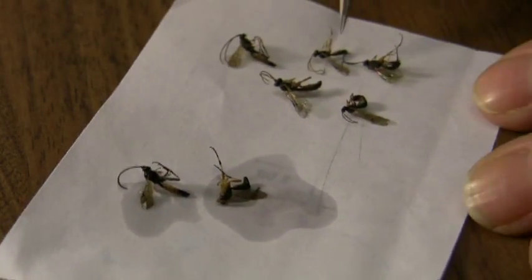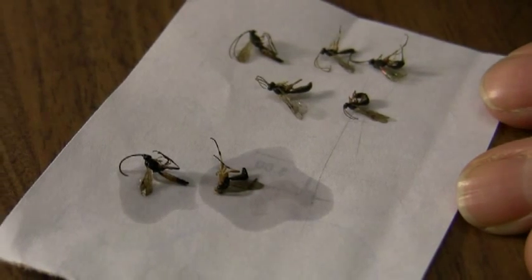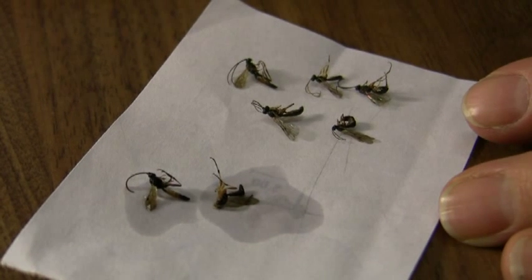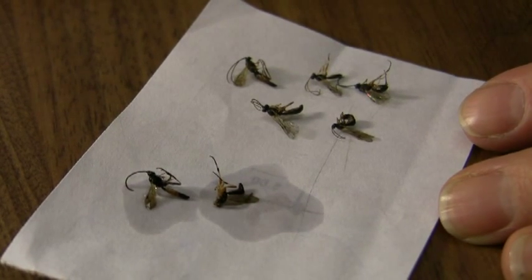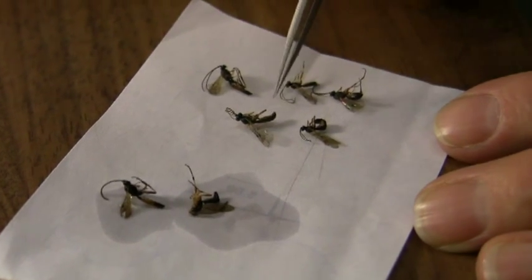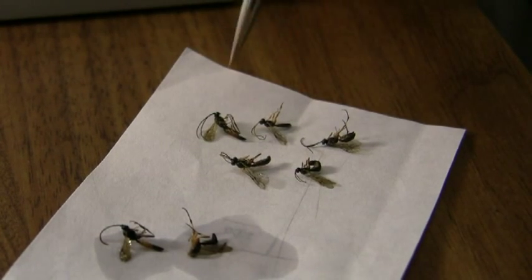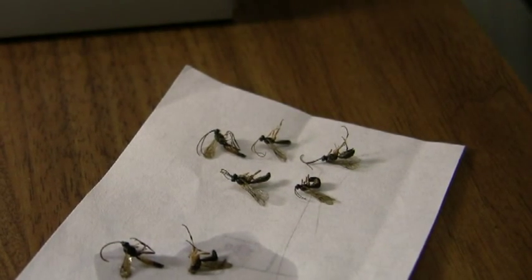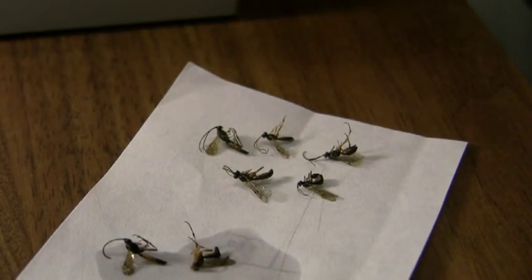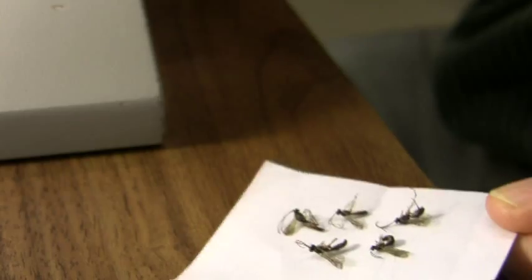These ones over here I did a few minutes ago, and this doesn't take very long. It takes maybe about 5 minutes in the 95% alcohol to dehydrate the wings a little bit more. And then on the paper, just move them around, and in about 5 minutes they'll be ready to go. So these 5 specimens here are ready to be glued on the side of the pin. All right, I'm just going to move these over to under the microscope.